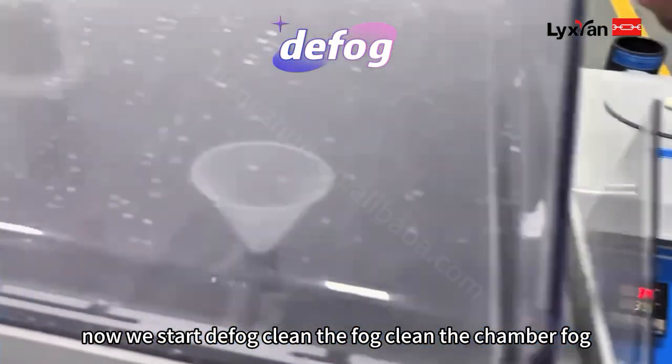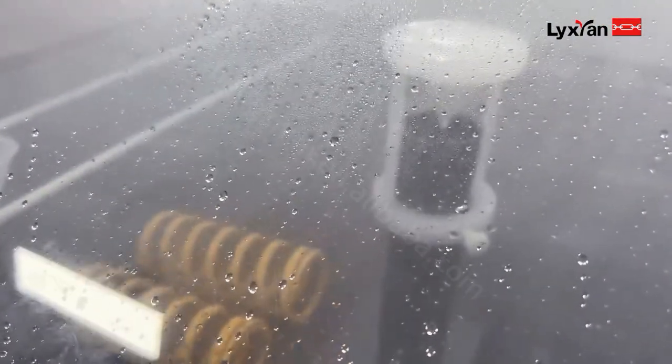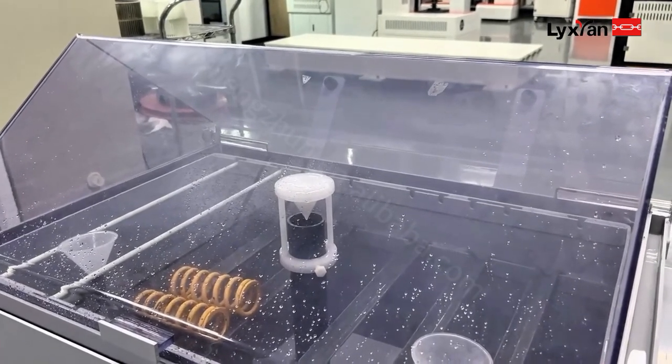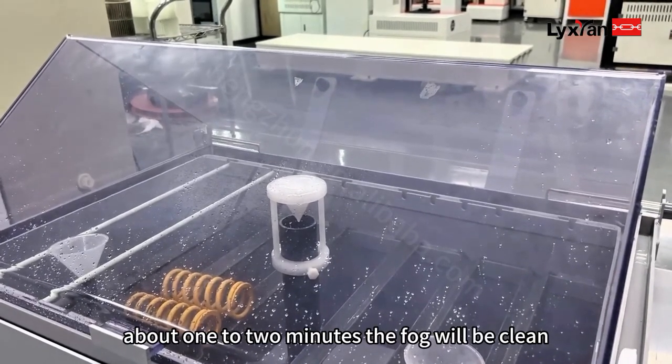Now we start the flush cycle. Clean the fog nozzle — clean the chamber nozzle. About one to two minutes, the nozzle will be cleaned.